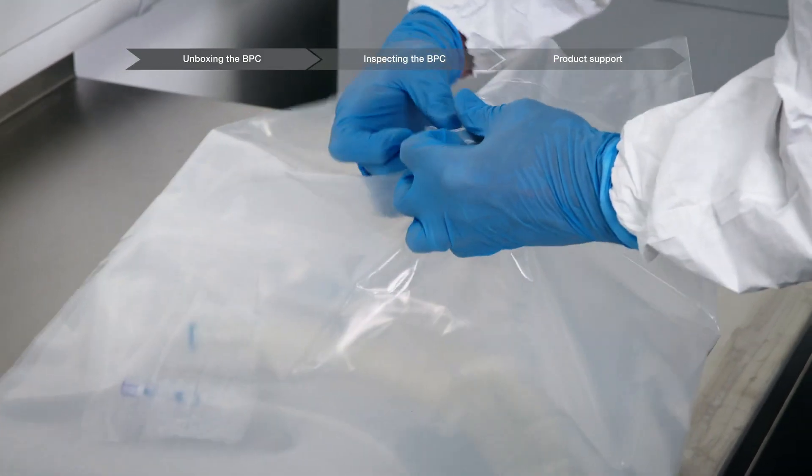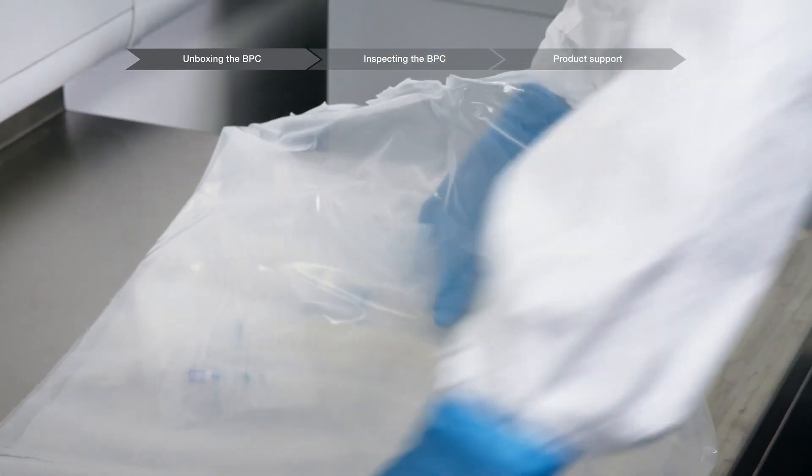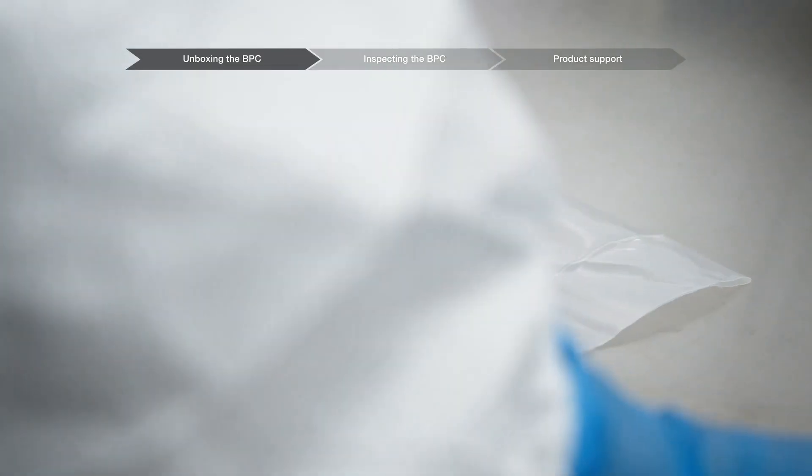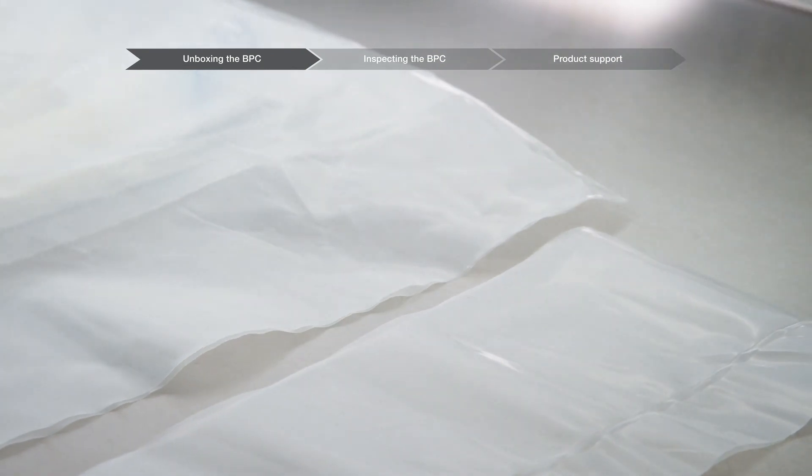When you are ready to open the poly bag, use a finger to punch a hole through the end of the poly bag and manually tear it open using both hands. If necessary, run a safety cutter or another similar tool along the edge of the poly bag to open instead.